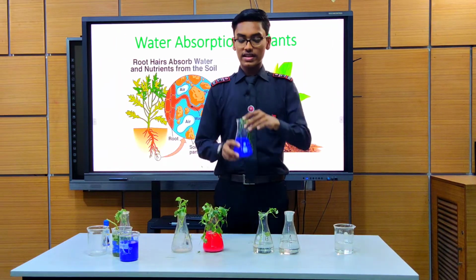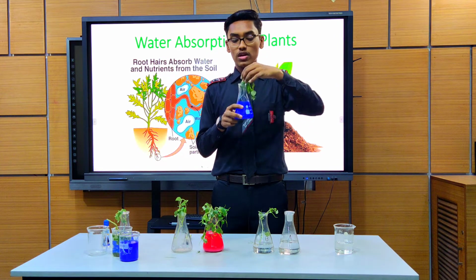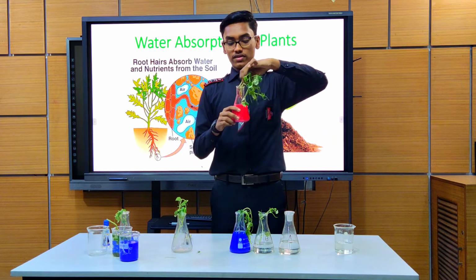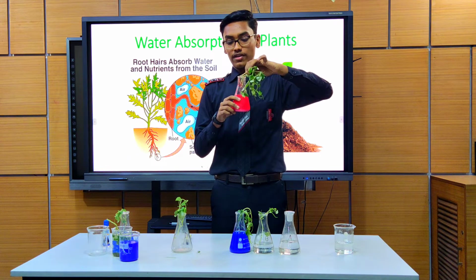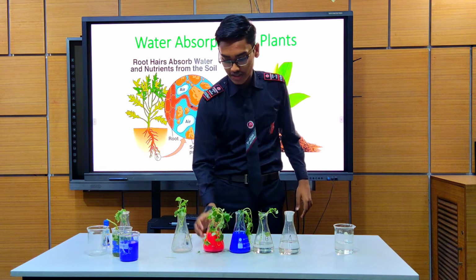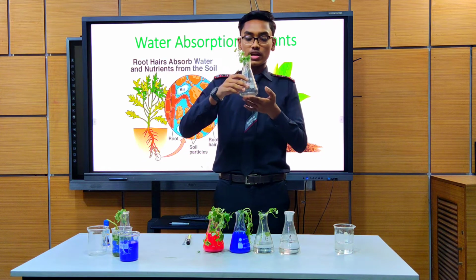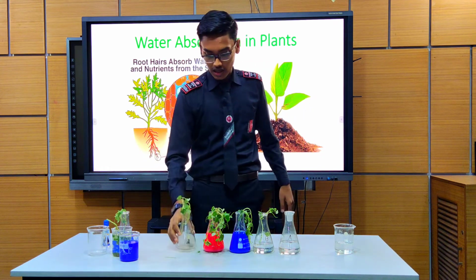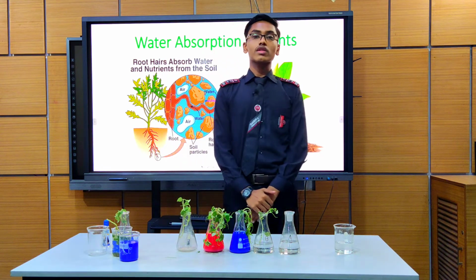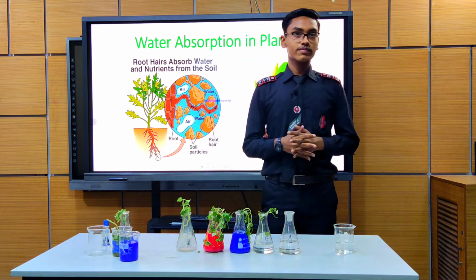Moving to beaker C, we can see that the water level has also decreased and the stem and leaves have turned blue. And if we go next to this beaker, we can see the leaves and stems have also turned red because they have taken in red color. After moving to beaker D, we can see that the beaker is quite empty because there was insufficient water at the time of the practical. Now this is all I have observed throughout the experiment. Do you guys have any questions?